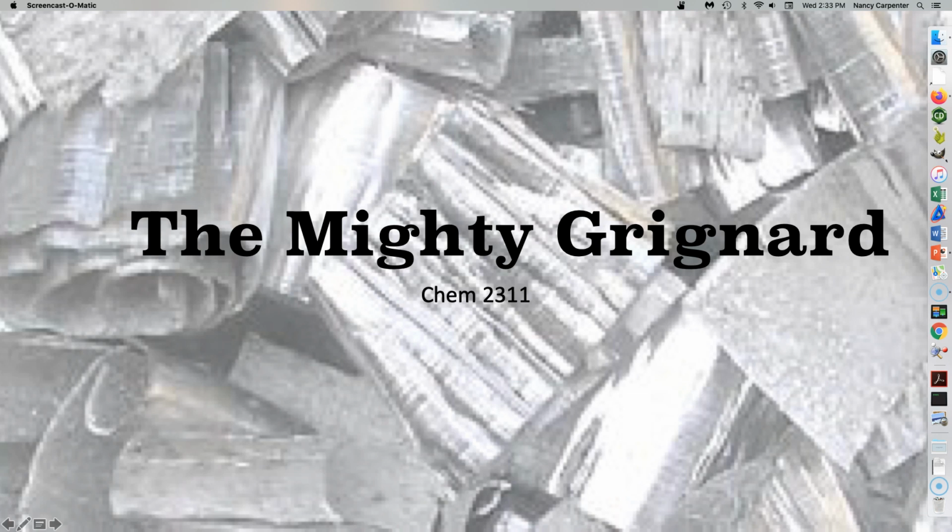Well, this will wrap up your adventure in organic chemistry lab with a really fun and possibly exciting kind of reaction called the Grignard reaction. The main player in the Grignard reaction is magnesium, so that's what the backdrop is for this slide.